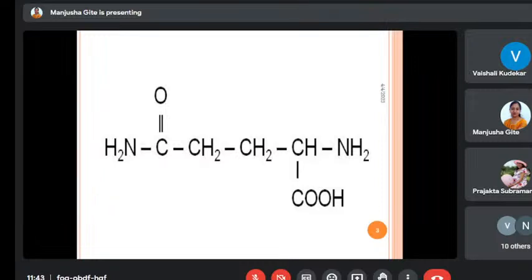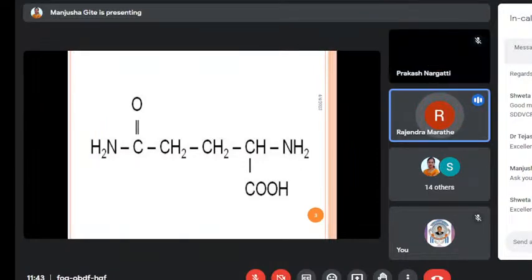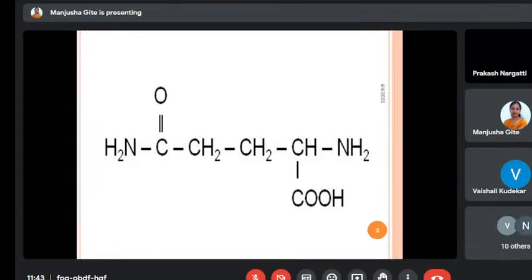Students and research scholars and most people are making a mistake here in mass spectroscopy. They are simply sending samples to the concerned organization for MS, but not telling them the exact molecular weight. Observe whatever mass spectra students attach to their dissertations for MPharm, PhD, etc. If you tell them the approximate molecular weight of your compound, then they will scan in that range only.